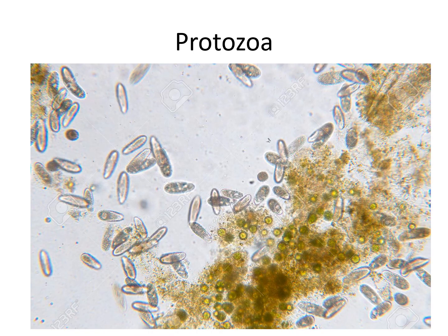Another sample that you will observe are live protozoa. So protozoa are a type of eukaryotic cells, so they're much larger, they'll be easier to see, and these are alive, so they will be swimming around in a water solution. So you will be able to see them and many different types of protozoa in the sample.